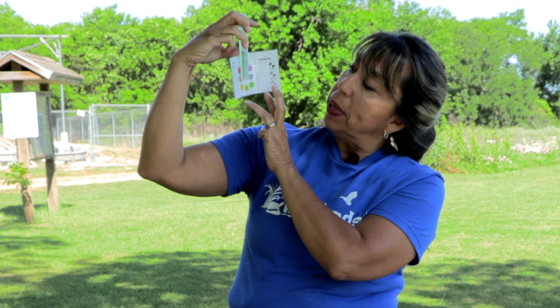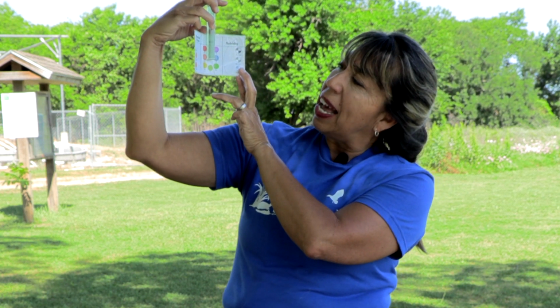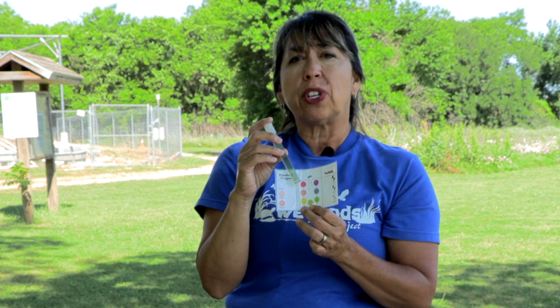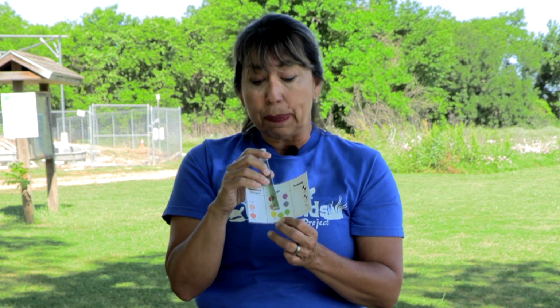So if you can't really tell, just bring it right up towards the sun, and I can kind of see it's between a 7 and an 8, which in our case, being out here at the Lake Waco Wetlands, that's perfect. It's great. I would be more concerned if it was less than or a lot higher than the 8 or the 7 itself. So this is telling me this is where it needs to be, right in here.